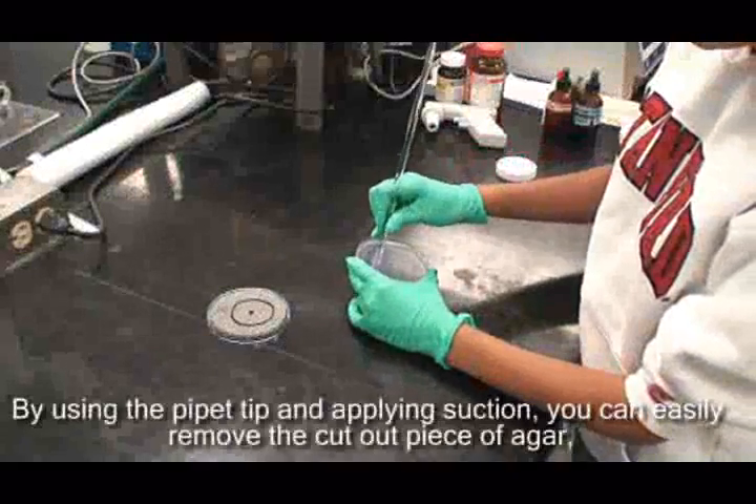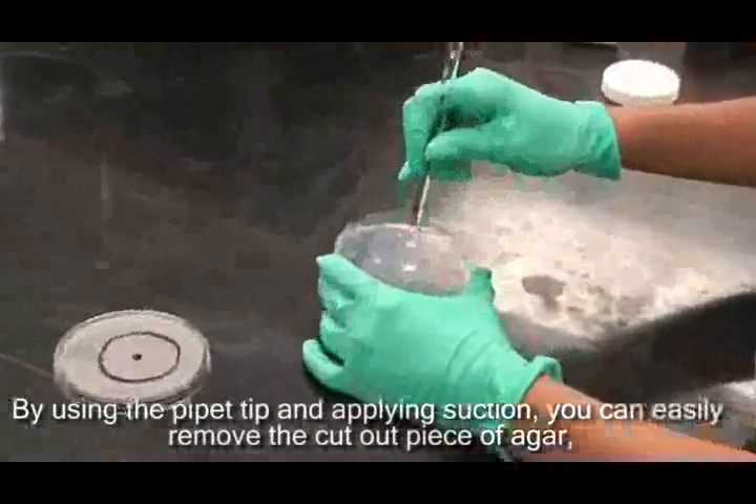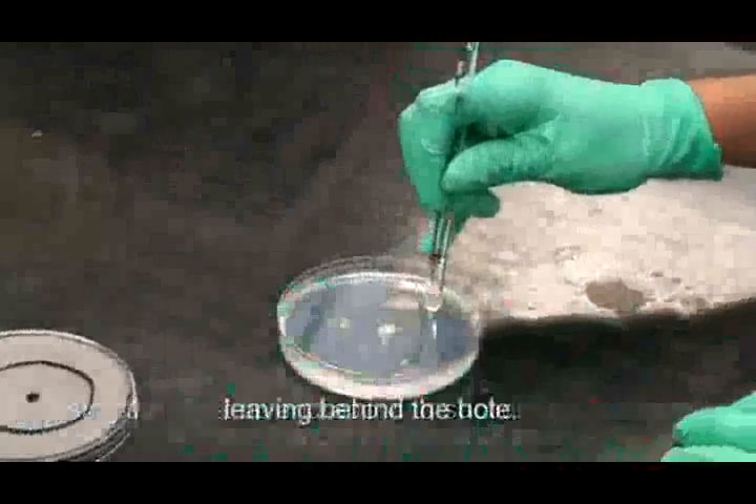By using the pipette tip and applying suction, you can easily remove the cutout pieces of the agar, leaving behind the hole.